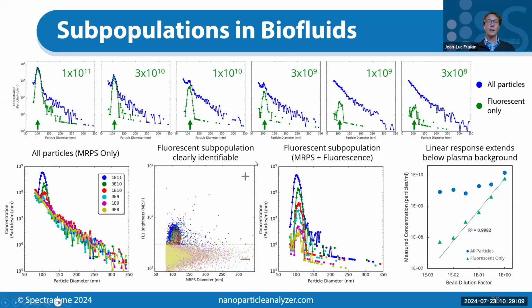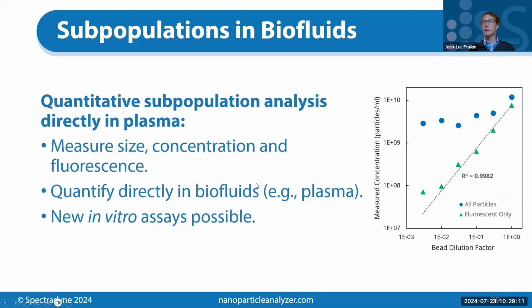All right, so that's what this example shows. And we think there's utility. We have customers that are interested in applying this technique to measure the fate of nanoparticles directly in complex media. So this is kind of like a PK test for nanomedicines directly in a relevant biofluid. I'll be happy to talk about that more in the Q&A after. It's kind of a different application.